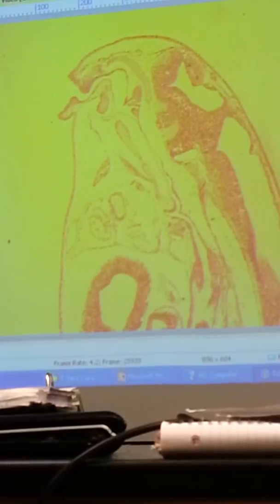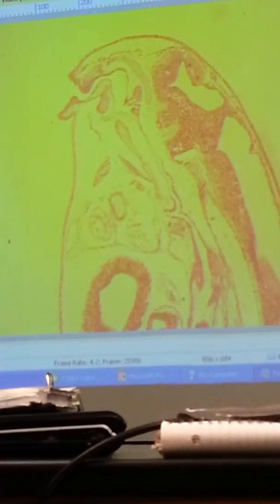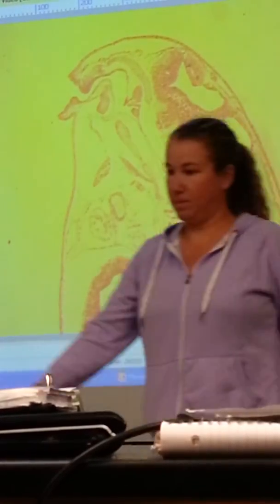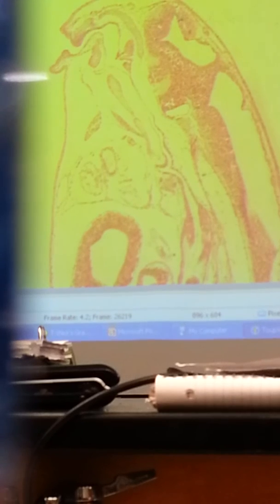You see? I'm going to take the camera and I'm pointing inside. And those two big ones. Numbers on this? Absolutely not. But if you get a really good slice, like Tyler's had, well, maybe you can see it. I don't know.